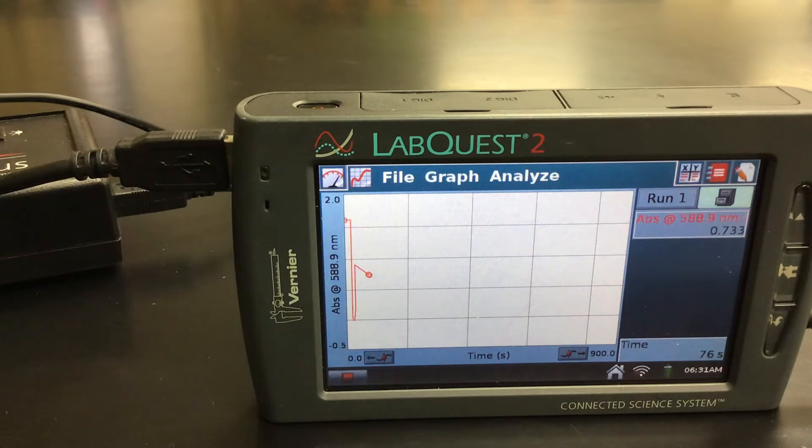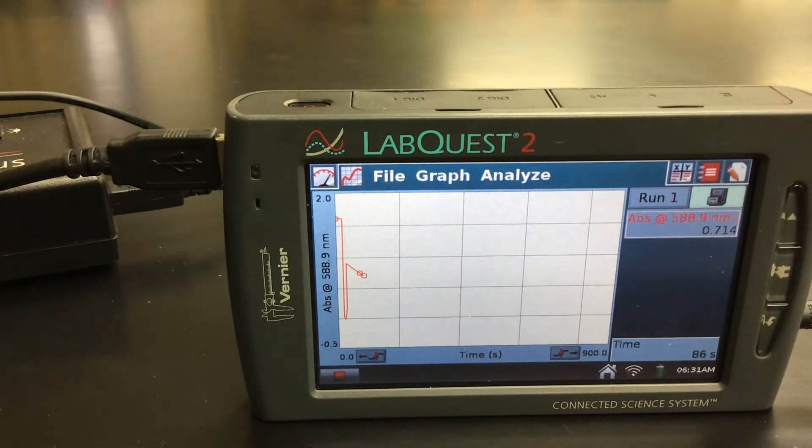So once our 900 seconds is up, we'll be able to analyze our curve and have the LabQuest do that for us — to see if it's zero order, first order, or second order. So I'll let this run, but I won't make you watch the whole time. Once the data is collected, we'll go through the analysis.